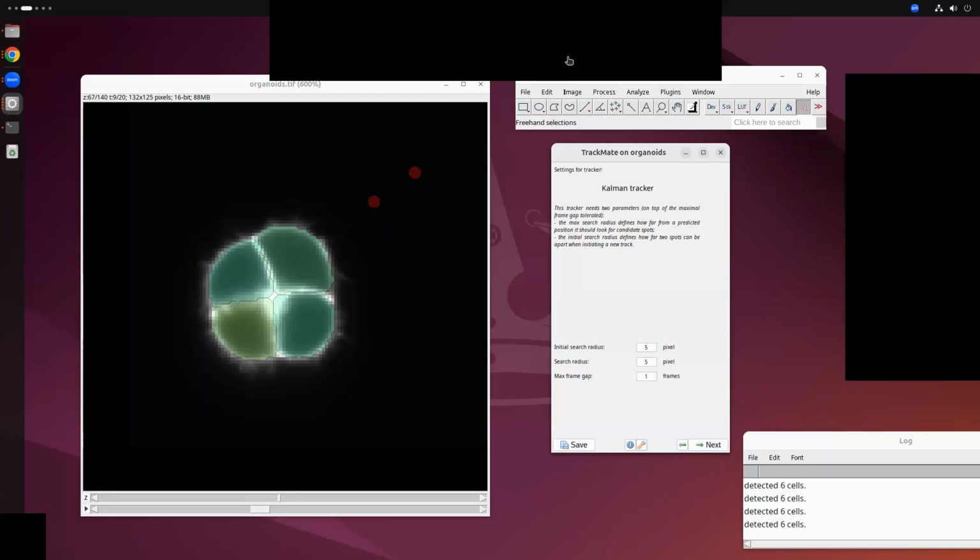So for the open server, we do a minor amount of logging. We don't currently save... Okay, the question is, are the images transferred to the server stored on the server as well? For the open server, I should have mentioned a few limitations. Because it's still in a very beta stage, and we cannot guarantee continuous funding support. So we're trying to keep it on as much as possible, but you can see there are downtimes. We don't have it up 24/7 yet.